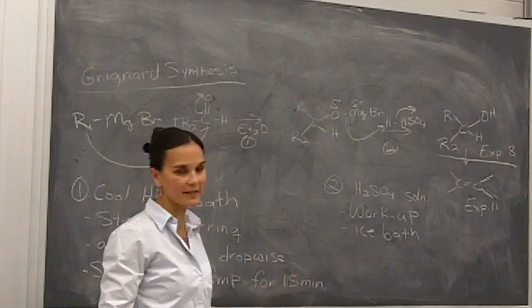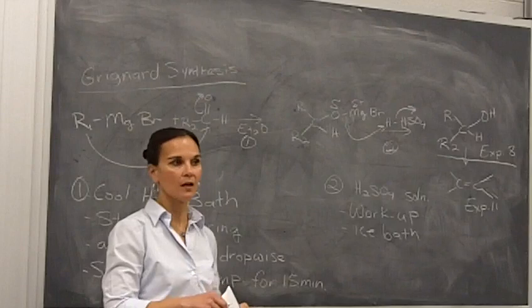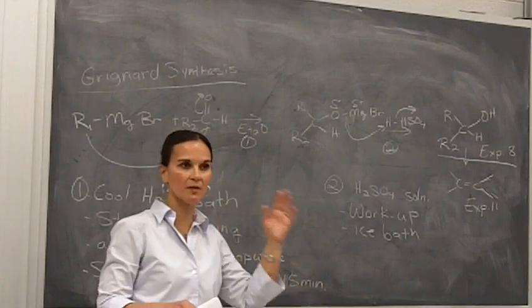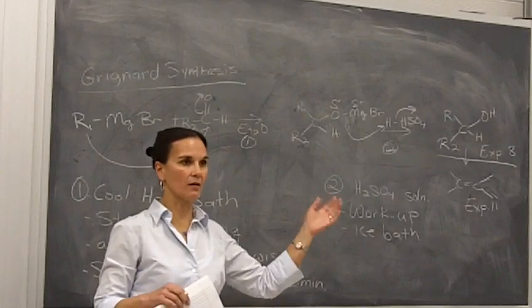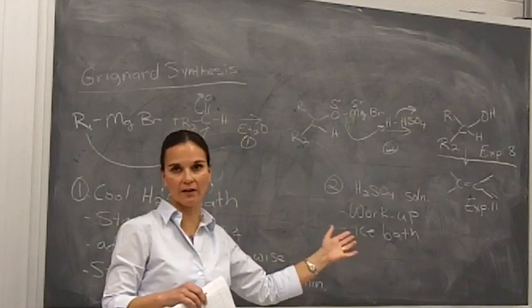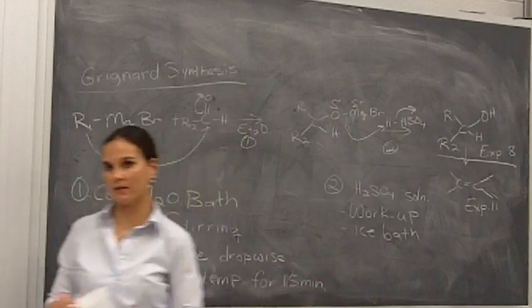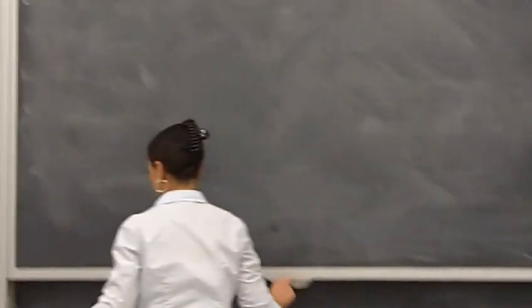What you will probably see is a lot of different things happening as you're adding it, okay? You'll probably see maybe some solid appearing, then disappearing. The magnesium's going to be reacting. It'll look like it's got too much stuff in it, and then it'll dilute out and clear out. So there's going to be a lot of changes that you see when you're adding the sulfuric acid solution. What is happening with that is a couple of things, okay?